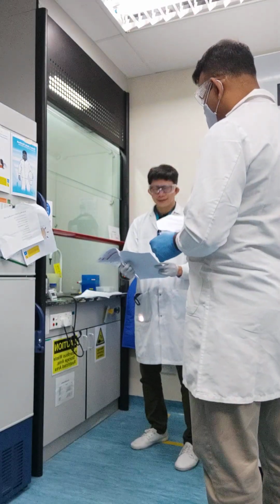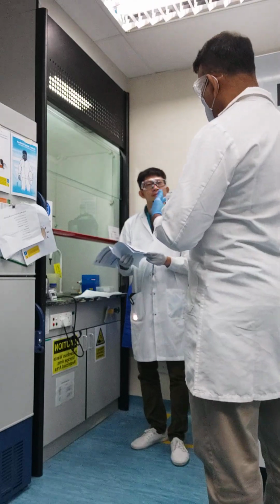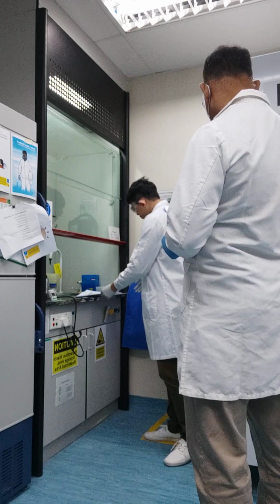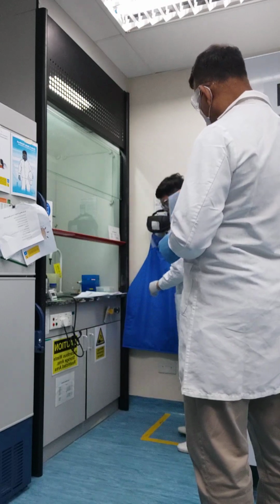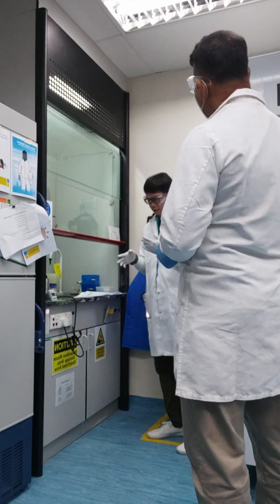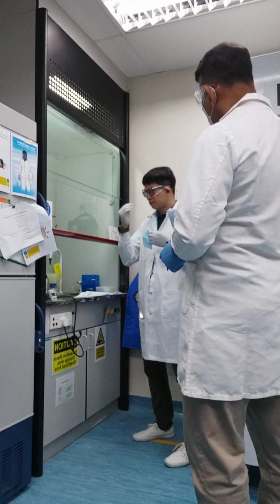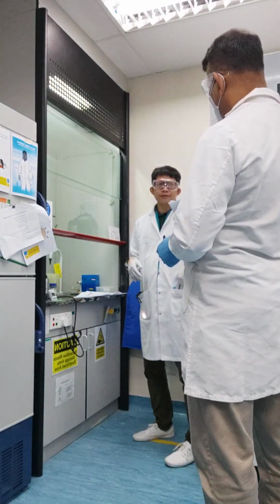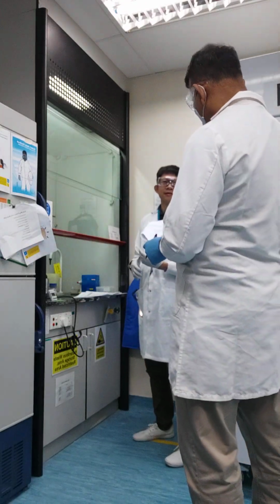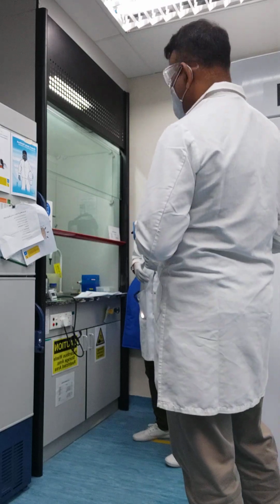Great. Excellent. In terms of the PPE, what are the PPE that are relevant for this task? I need to protect my body, so the apron, and my face shield in case of accidental splash. I may come in contact, so my gloves, and this mask is because I may breathe in the chemical. Am I right, Mr. Chandra? Yes, great job, Leon. In fact, you have answered all the questions correctly.